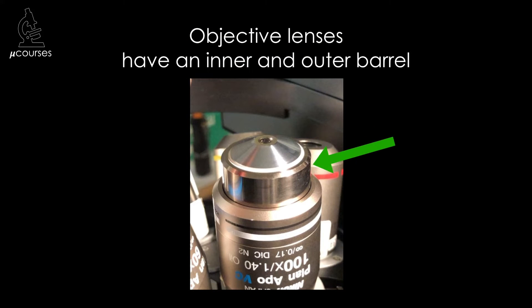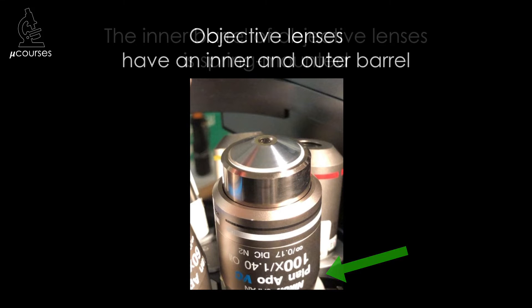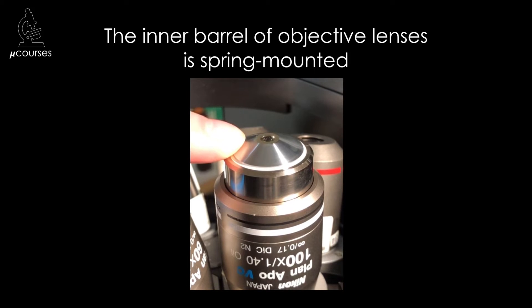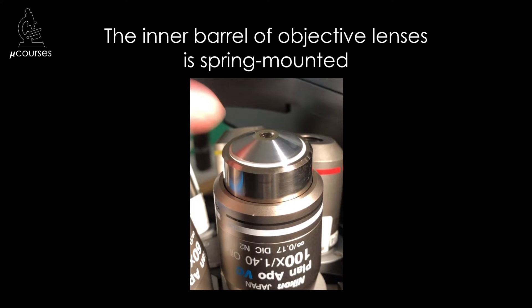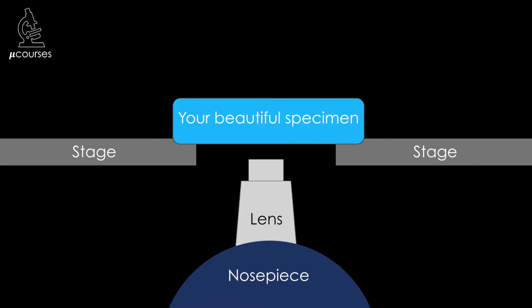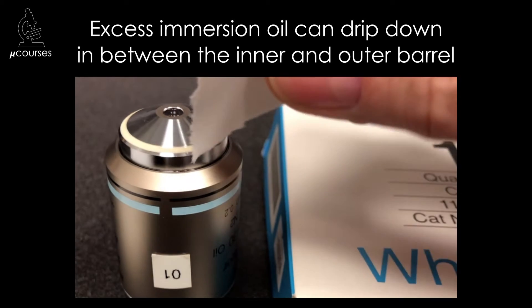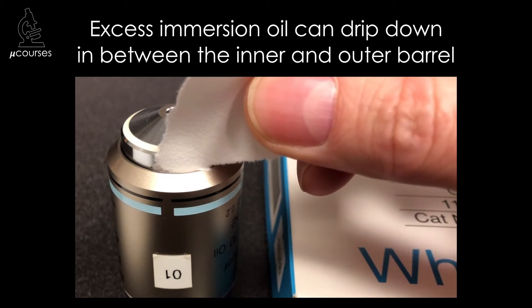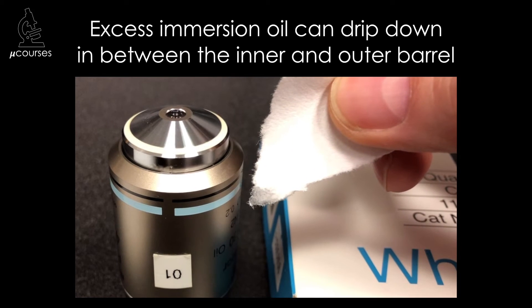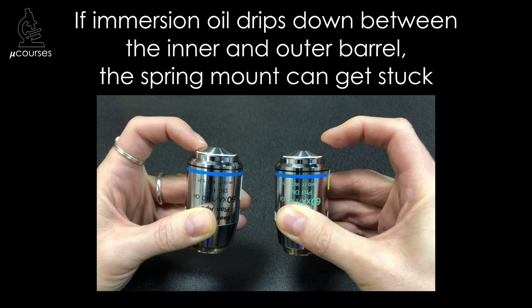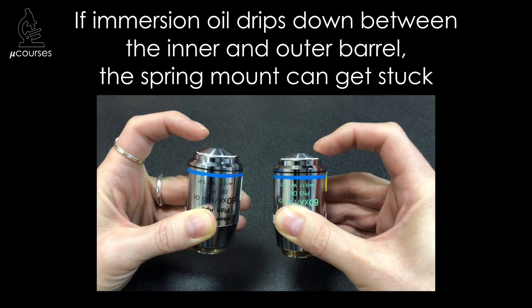Most objective lenses have an inner barrel and an outer barrel. The inner barrel is spring mounted so that if pressure is placed on it, it retracts into the outer barrel. This is a safety mechanism so that if, when you're focusing the objective lens, you miss the focal plane and continue to move the objective towards your sample, the lens has some space to retract before you break the sample. When too much immersion oil is used, it can drip down the side of the objective and get in between the inner and outer barrel, and since immersion oil dries over time it can get very sticky, so instead of retracting when pressure is placed on it, it will become stuck.